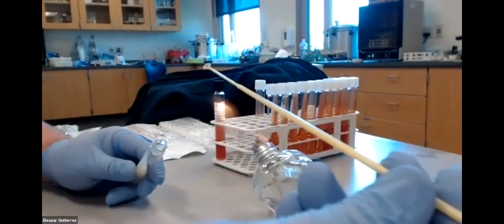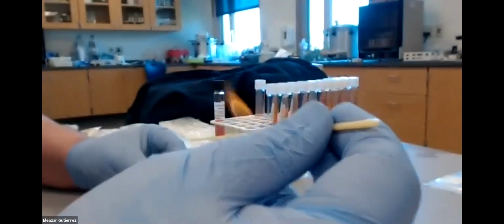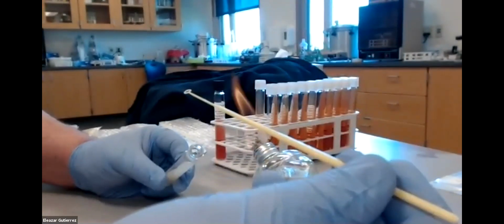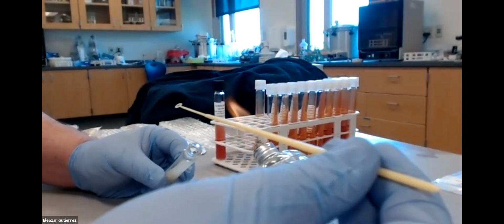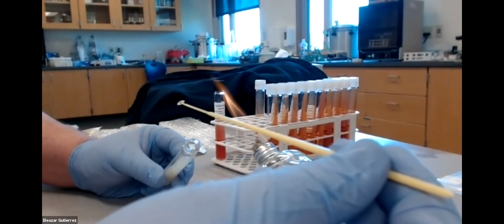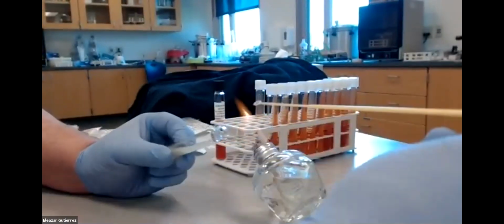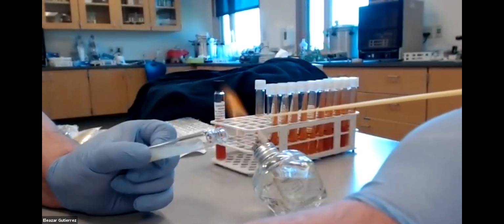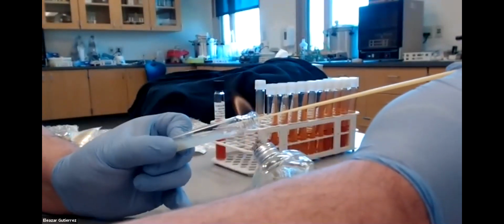I'm going to take my loop and I'm going to get an inoculum. I'm not going to break the media. If I break the media, I'm going to transfer agar. That's ridiculous. I don't need agar. I just need the E. coli that's growing on the surface. So I'm going to stick this in here. Hopefully you guys can see that. And go in there.